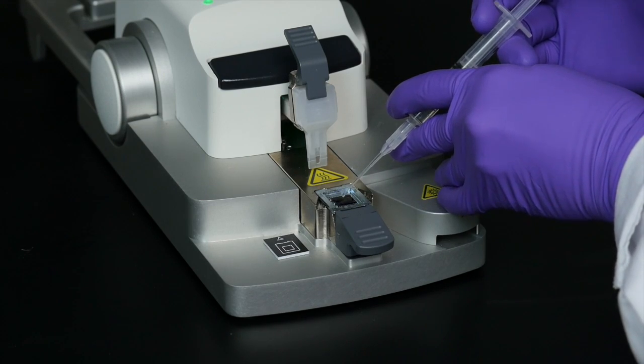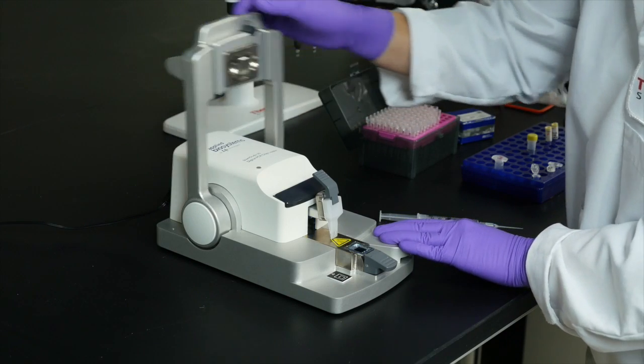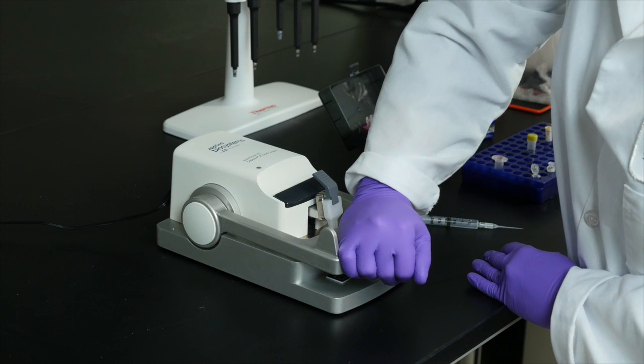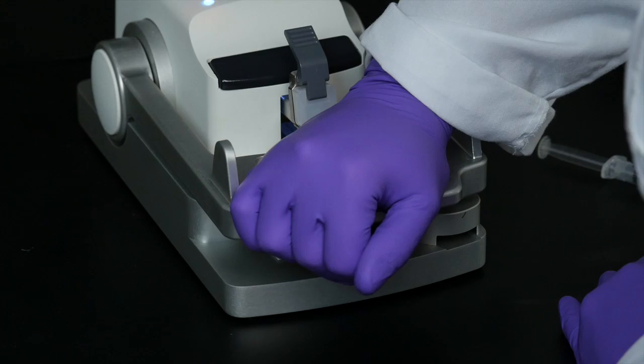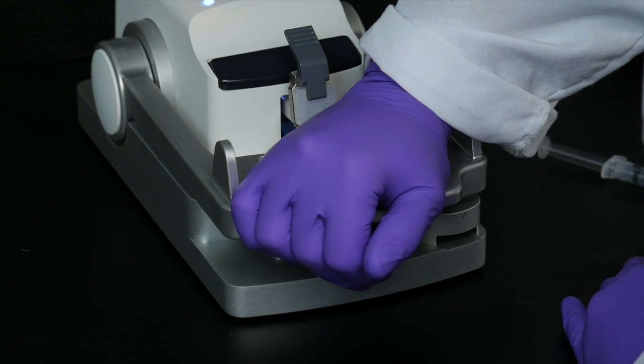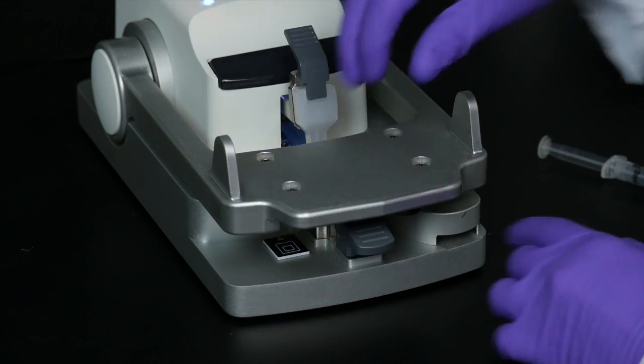The chip is ready to be sealed with the lid. Take the sealing arm and swing it across until the lid comes in contact with the chip base. To ensure a good seal, firm downward pressure for at least 15 seconds is recommended.